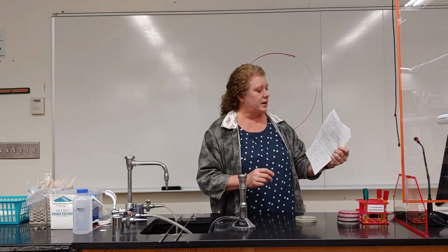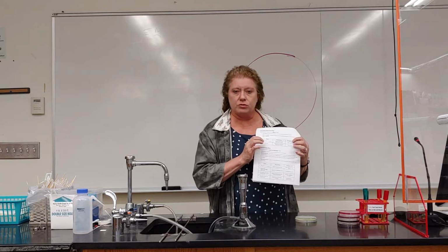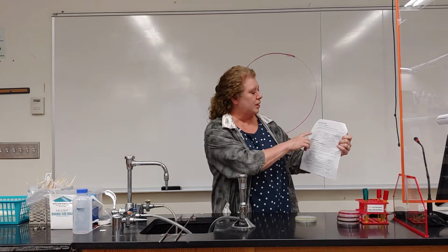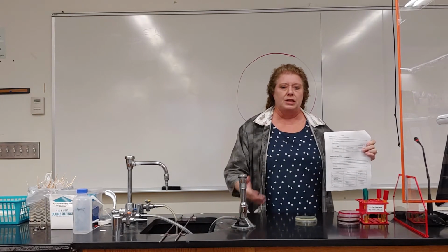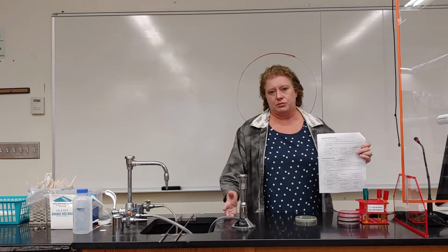So the PEA agar is only a selective media, so it's got a real short table and a short explanation. It tells you right at the top that it selects for gram-positive organisms, meaning it allows them to grow.